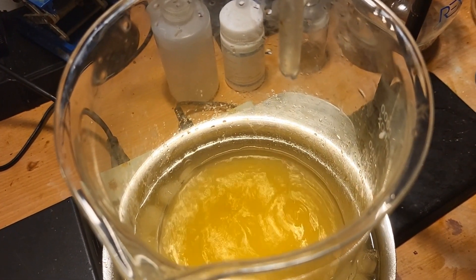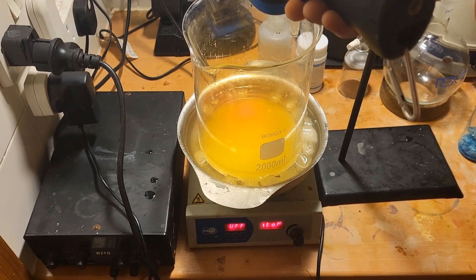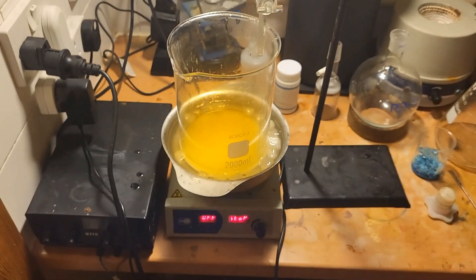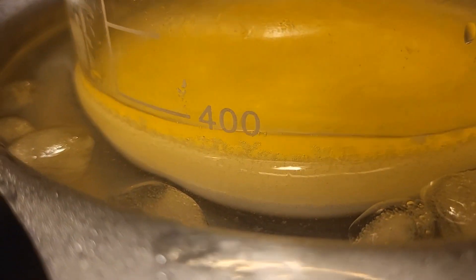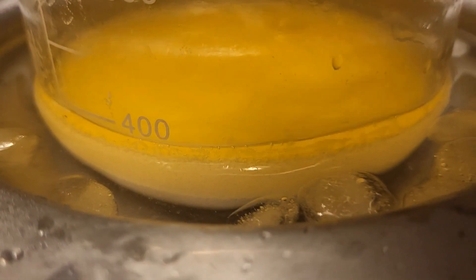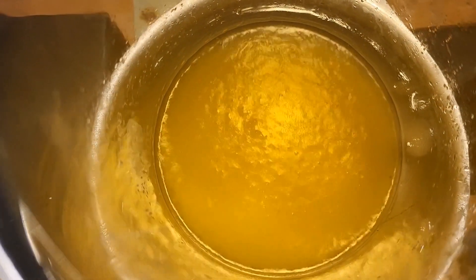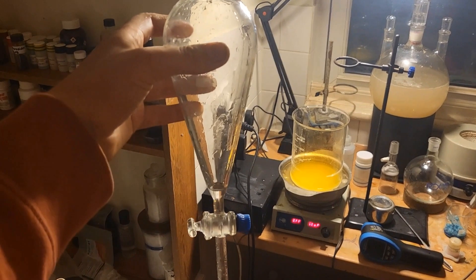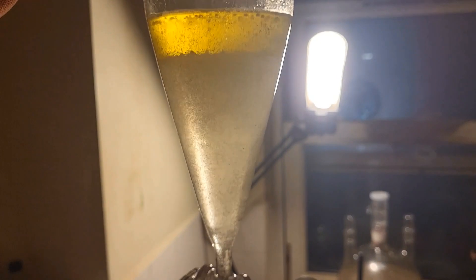Isopropyl nitrite is yellow in colour. We've got 20 degrees in there — let it cool down if I can. You can see that there is a yellow oily layer and that is our product. Unfortunately our product is slowly decomposing so we need to be fast. Decant the oily layer and some of the liquid to here — here it is on top, slowly decomposing. I'm going to remove this lower layer.